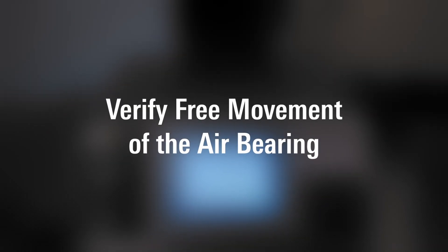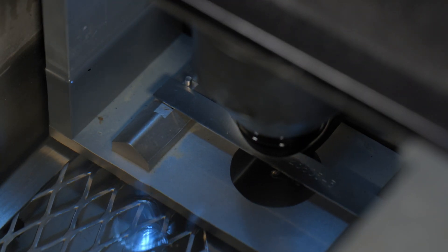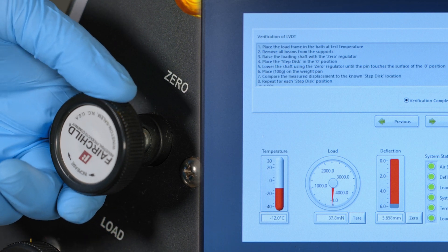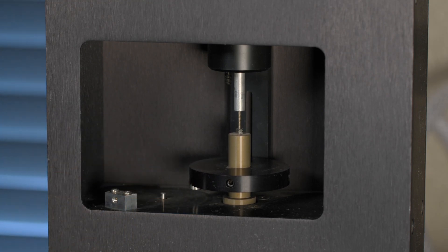Verify free movement of the air bearing. Place the thin steel beam in the bath and apply 35 plus or minus 10 mN using the zero regulator. Lift the shaft approximately 5 mm and release. It should immediately float downward and contact the beam.